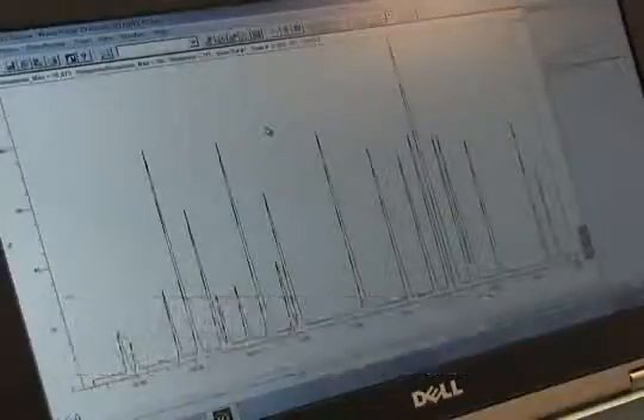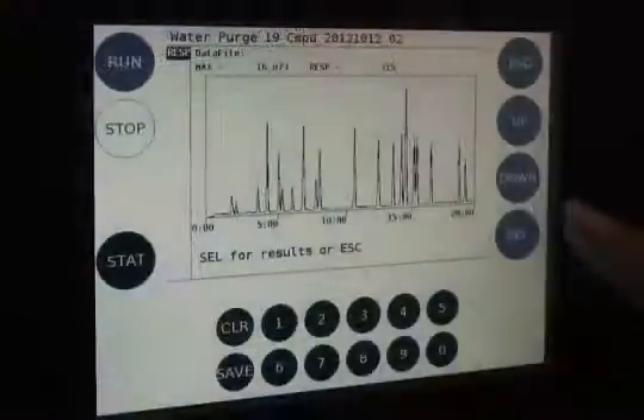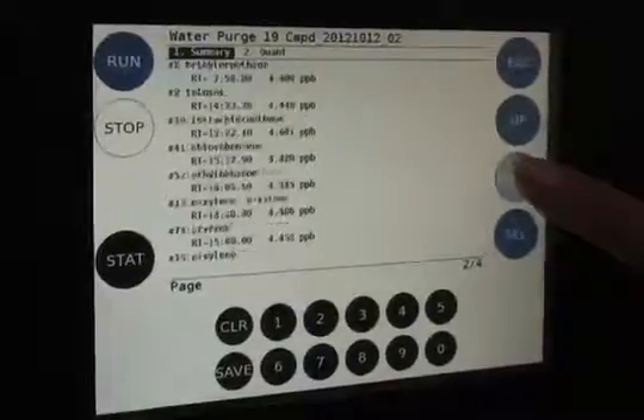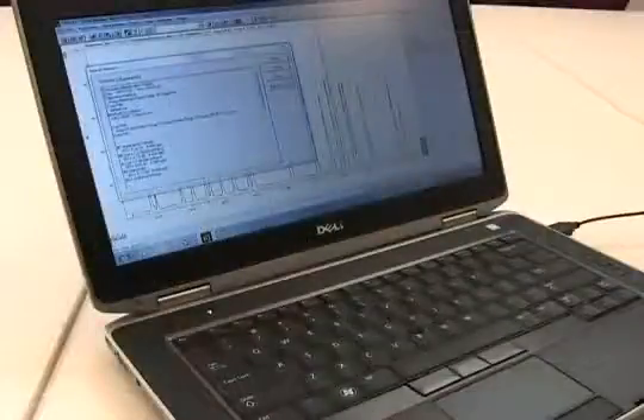The time at which the analytes elute from the column is known as the retention time. Press Select to view the quantitation report. Use the down button to scroll through the summary report. The compound name, retention time, and concentration will be displayed. Alternately, the report can be viewed on the laptop.